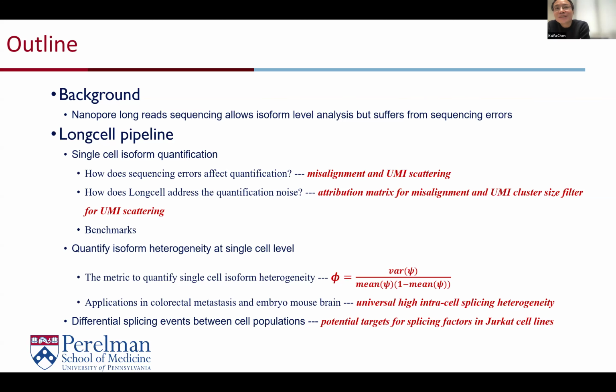High intracellular heterogeneity may denote that both isoforms are very functionally important to maintain the regular cell dynamics, while high intercellular heterogeneity may denote some kind of tendency for a very specialized mechanism of that kind of cell type. That's my intuition for this, but I haven't gone through all genes with high intracellular heterogeneity.